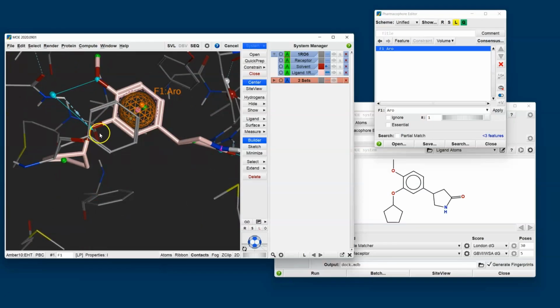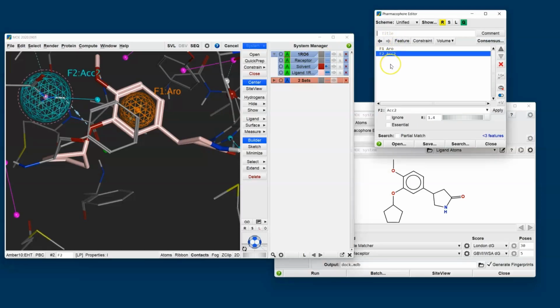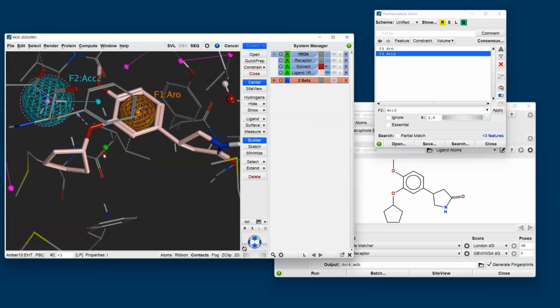So rather than second guess which one of these annotation points or projected annotation points I should be using, what I'm going to do is just toggle off the ligand annotation points, and I'll make my selection on the receptor instead. So I'm just toggling on the annotation point for the receptor, which allows me to select the annotation point sat directly on the receptor and generate a feature from that. So that's it. We've generated our pharmacophore.